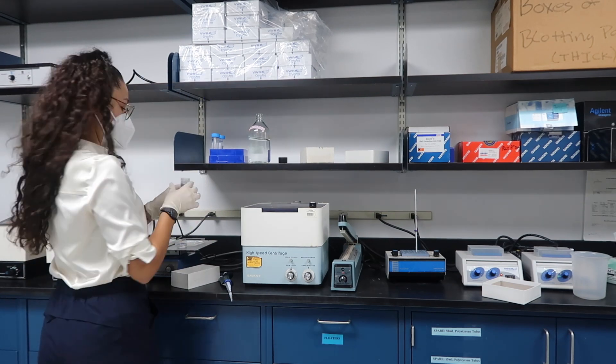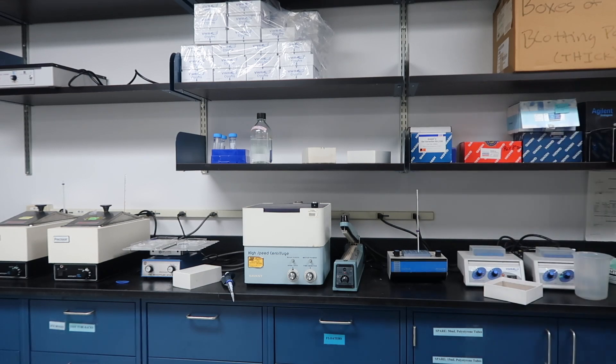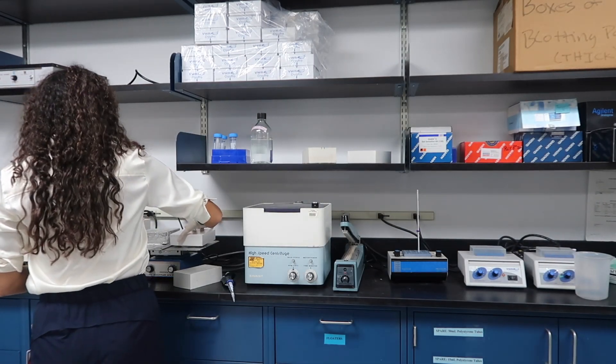Bartending skills! Hey Siri, set timer for 10 minutes. There's like a 10 to 12 dollar fee to schedule a pickup, but UPS comes by all the time so I'm just gonna wait until I see someone and ask them to pick it up. And time for the next wash.